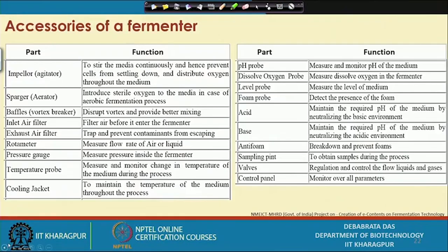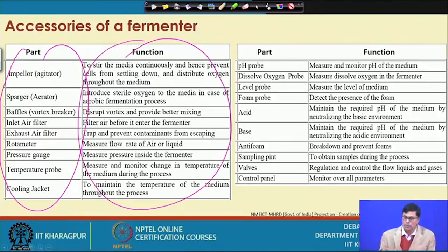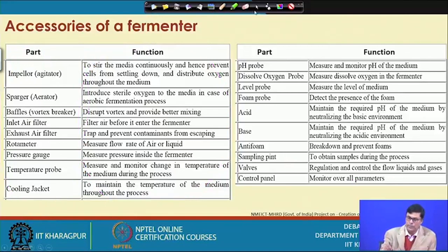So, this is the summary of the different parts that are present in the fermenter. This is the function of the fermenter. I do not like to go into details again, I already explained, and these are the different parts explained here. So, this is a kind of repetition of that.